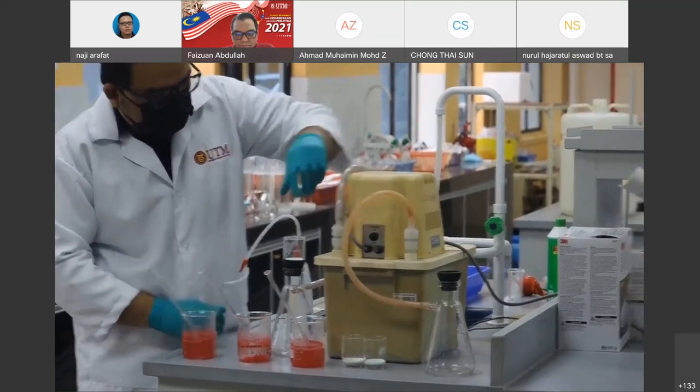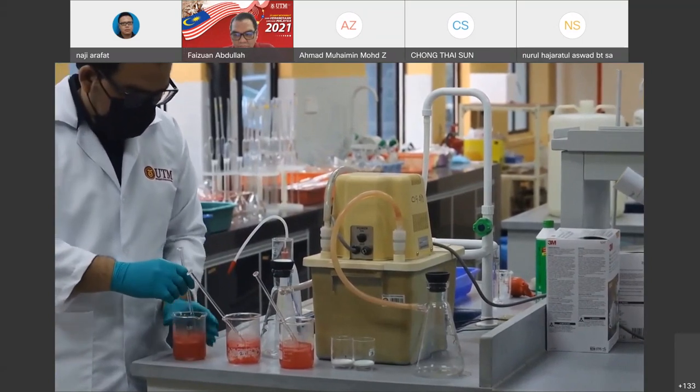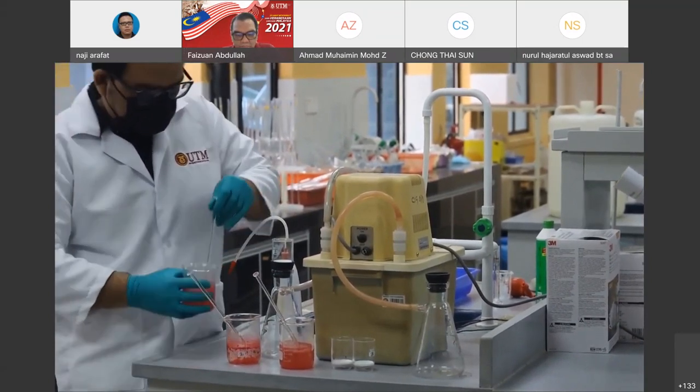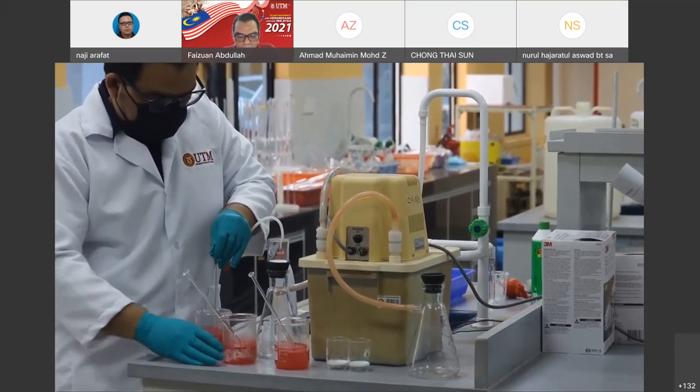Now, I'm turning on this filtration unit. I'm going to filter each of the replicates through the weighed sintered crucible using this suction filtration.